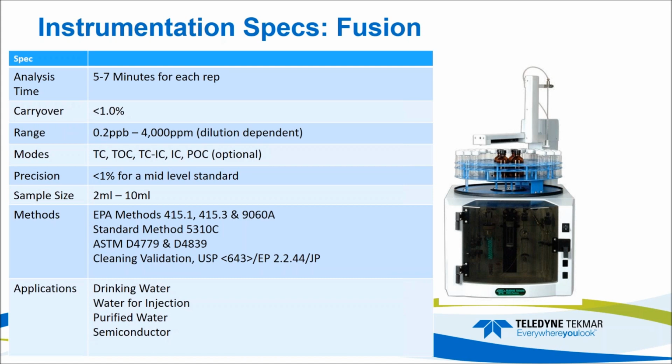It can do a variety of different modes. It can do total carbon, total organic carbon, total carbon minus inorganic carbon, which is what is used in Canada as their standard method, just inorganic carbon, and then we have an optional accessory for purgeable organic carbon.